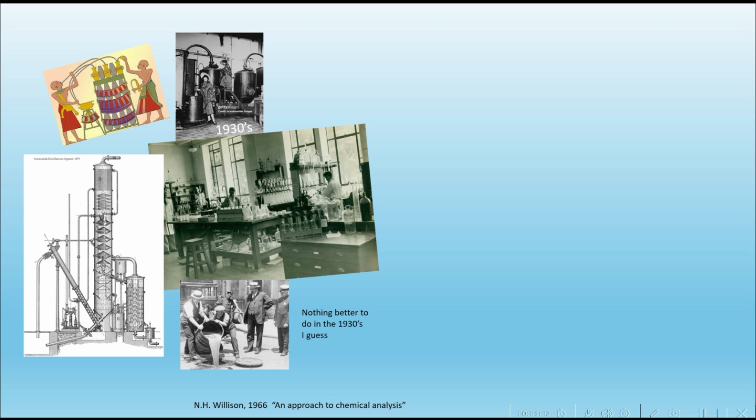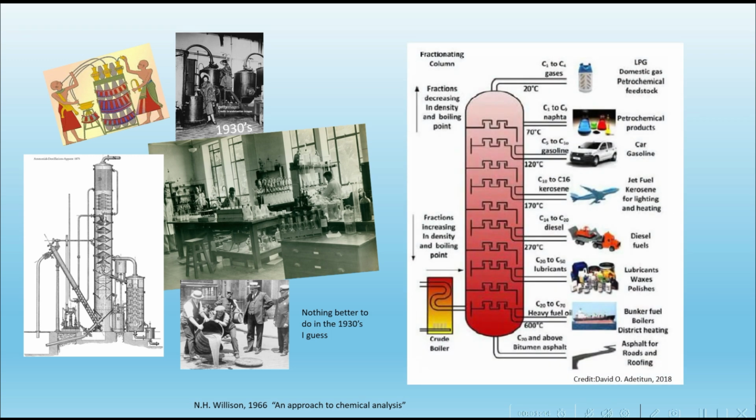Distillation towers for petroleum are made out of a stack of actual plates. At each plate, there is an equilibrium between the different substances. Lighter agents like gasoline and jet fuel float to the top, and heavier substances like asphalt sink to the bottom. In the laboratory, we don't use actual plates. Instead, we use plates as a unit of measure.